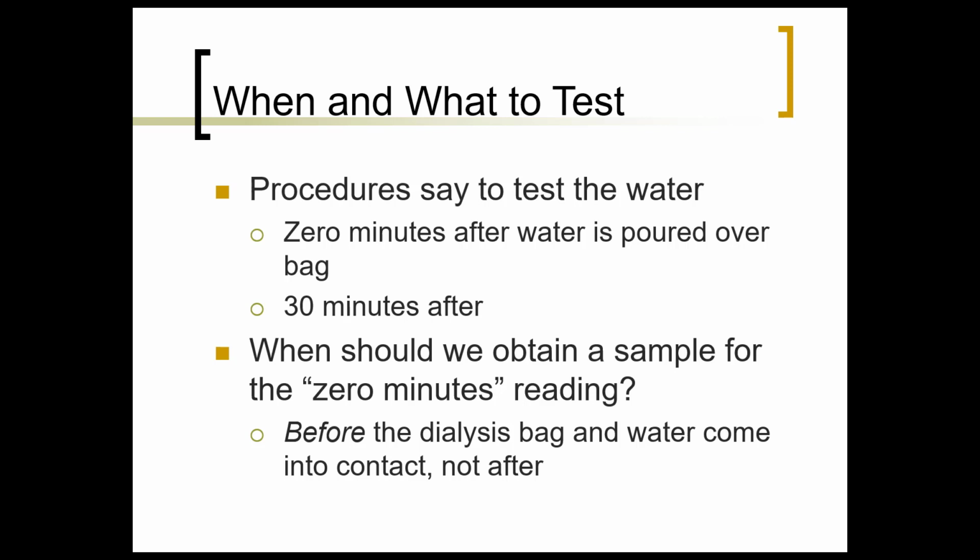If we are truly to test the contents of the water at the instant the experiment begins, it makes far greater sense to test the water before it even touches the dialysis bag. Whether we test the water 1 second or 5 seconds or even 500 seconds before it comes into contact with the dialysis bag is totally irrelevant. The point is that the composition of the water should give the same test results at any of those times up until the bag is actually added.